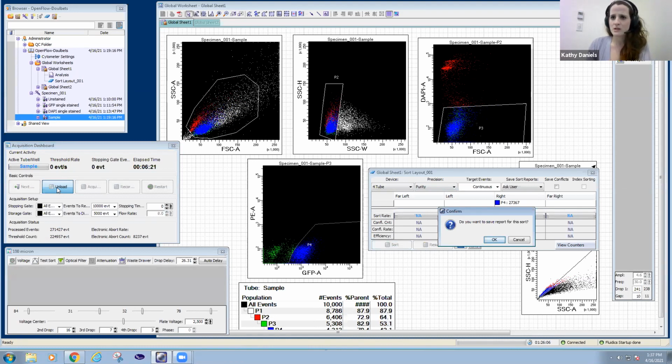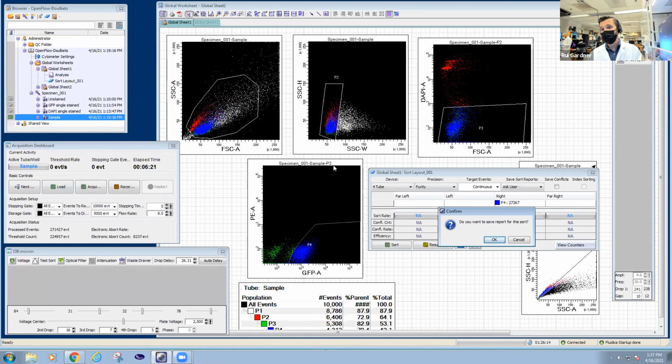And then we have one more question that came through, asking if you can sort with bi-exponential axes on the plots. Yes, we can sort with bi-exponential. The only thing we need to be careful with is that the gate is not below 0 in any of the parameters. This is a limitation of Diva. You won't see this most likely in other instruments, but this is a limitation that Diva has. So you just want to be careful with that. But you can sort in bi-exponential, yes.